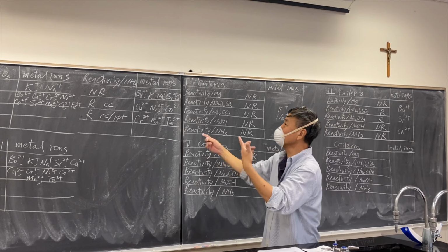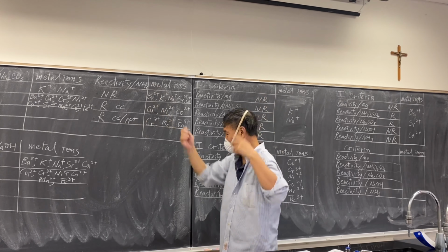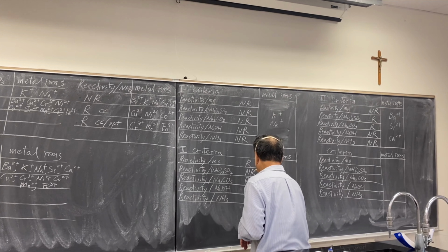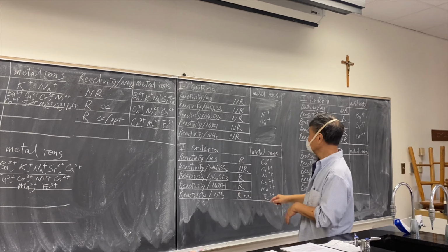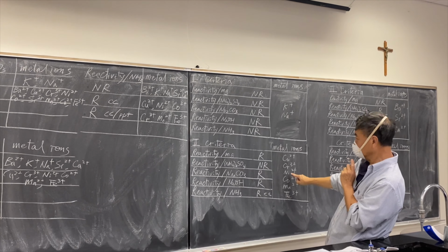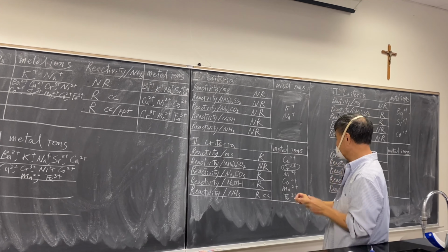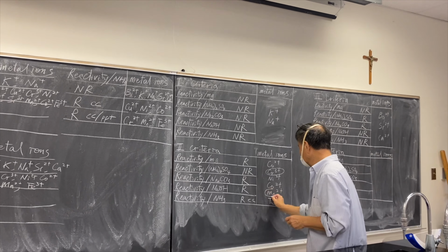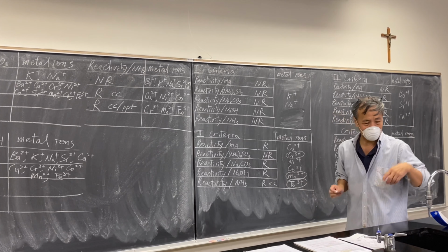So we're going to single those out. I see color change first. So I say, all right, reaction with a color change only. And that will be copper 2, nickel 2, and cobalt 2. Chromium 3 singled out, manganese 2 singled out, iron 3 singled out.